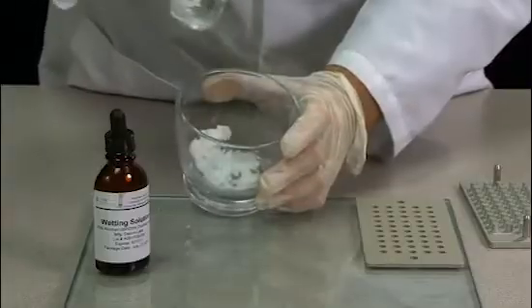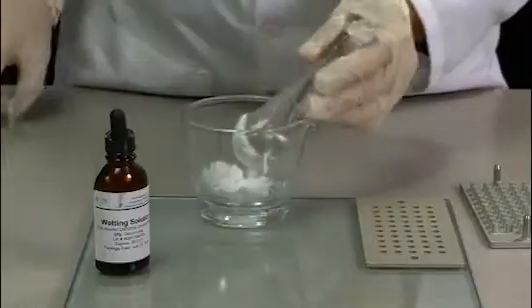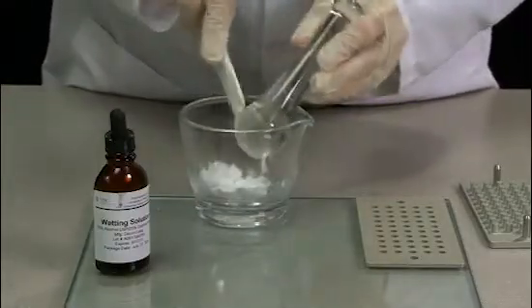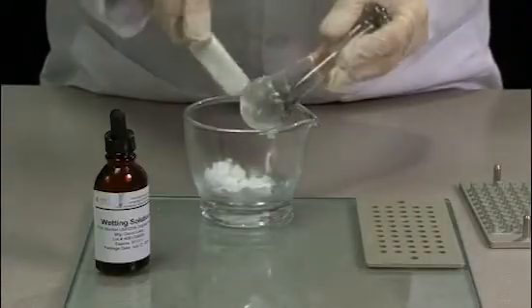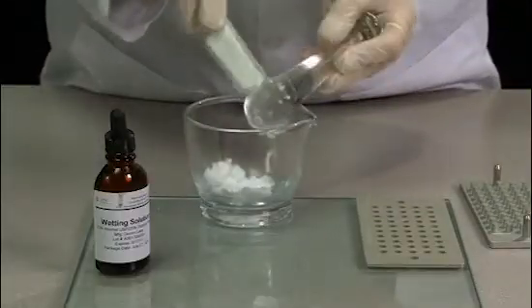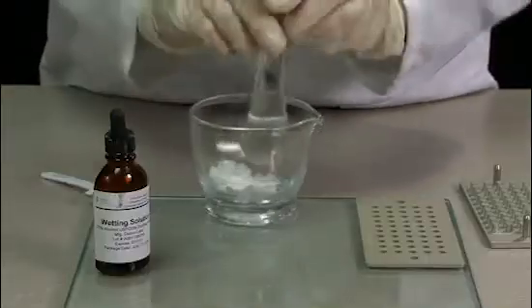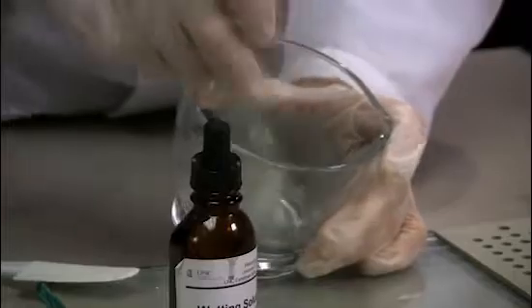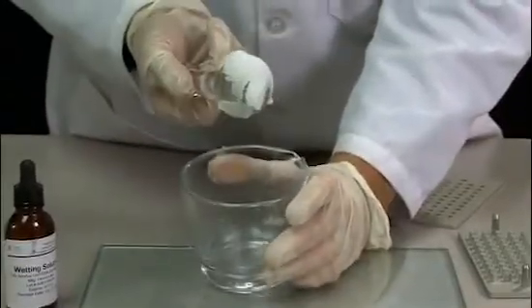Again, you can see that the powder is no longer a free-flowing powder, but is much more of a paste-like or aggregate-type powder. To make sure that wetting is uniform, scrape the powders off the pestle because they will contain wetting solution as well. At one point in time, all of the powder will adhere to the pestle.